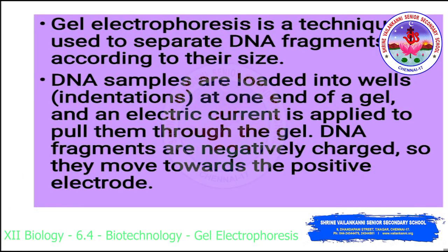Gel electrophoresis is a technique used to separate DNA fragments according to their size. DNA samples are loaded into wells at one end of a gel. When we are loading the DNA sample, that process we call loading. And an electric current is applied to pull them through the gel.